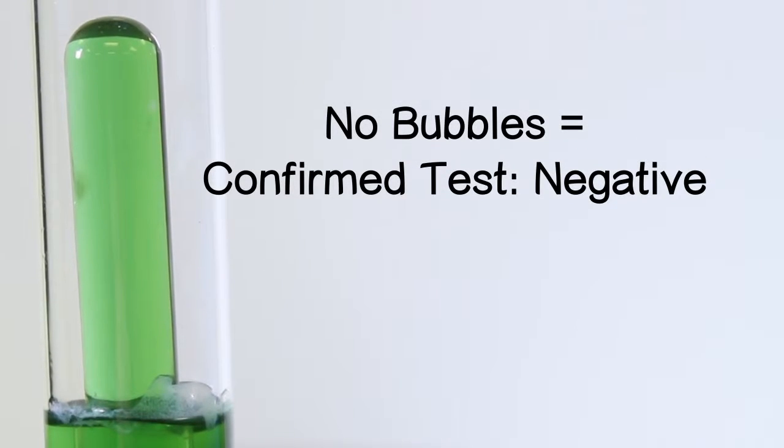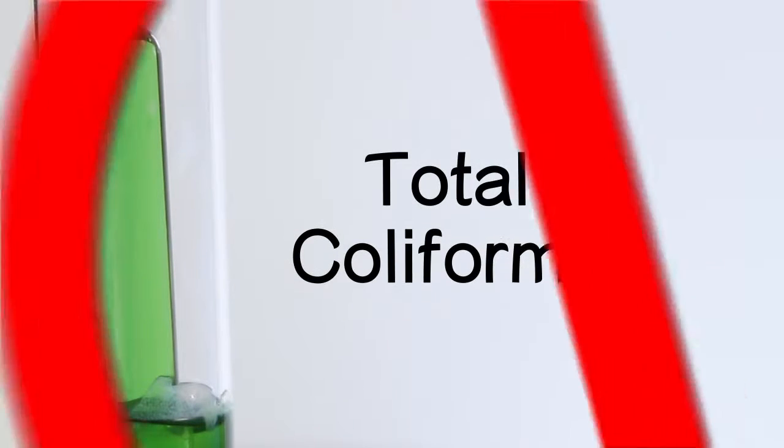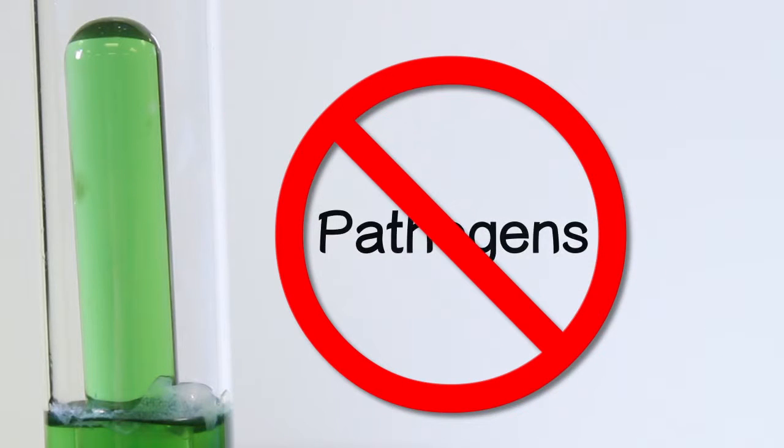If no gas bubble is evident after an additional 48 hours of incubation, then the confirmed test is negative. This means that there are no total coliforms, and thus no pathogens, and our analysis is concluded. If a bubble is apparent, then the test is positive for total coliforms.